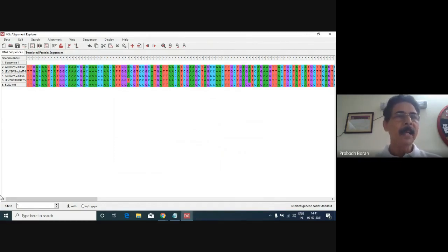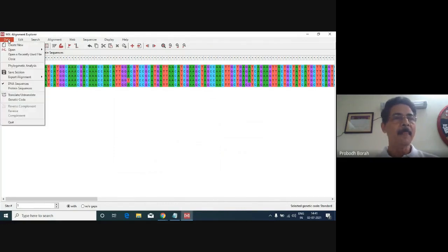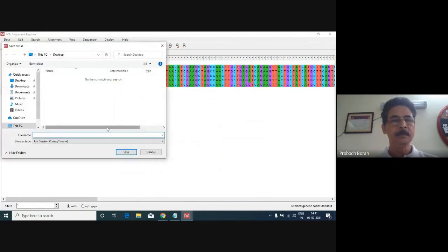Okay? Then, after this, we are to save this file by giving a name, save this session. So go to Data, then click Save Session. It will automatically create a .mas file, as I said in the previous class.